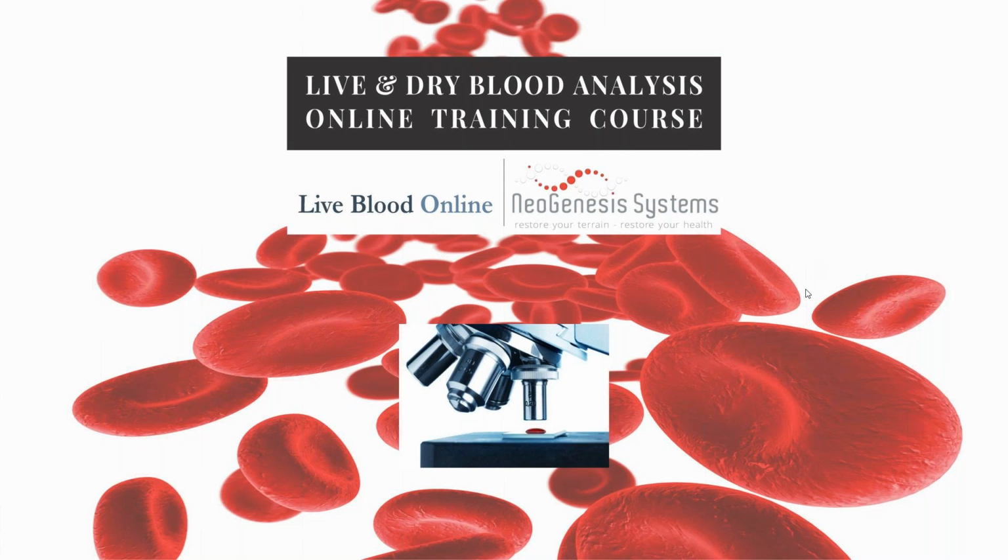So, for practitioners who have not had any exposure to live blood analysis, perhaps have not seen it being done before, it might seem a difficult sort of idea to grasp, and what we would actually be looking for in the blood. So I just have a few examples of the type of images that we're able to get with a live blood sample and also a dry blood sample, and also just for clarification as well, the different types of views that we use.